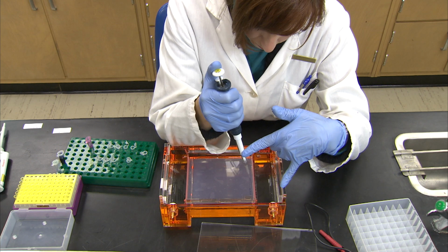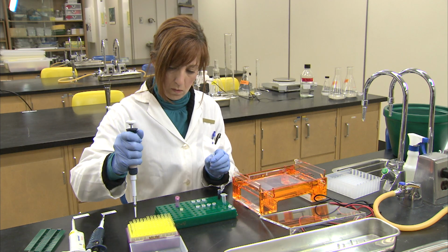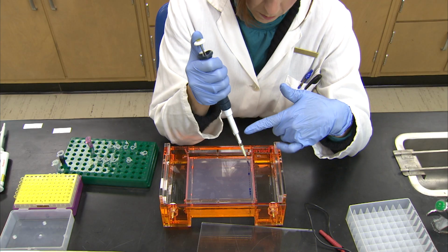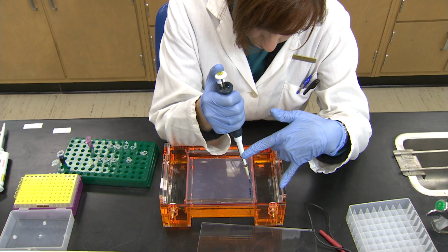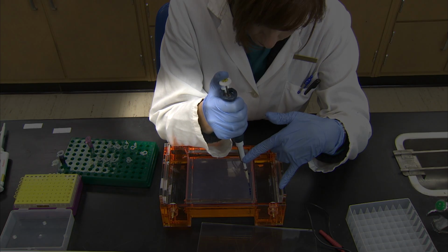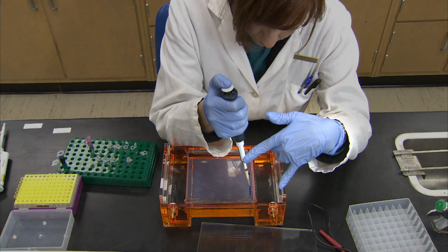Now that all the samples are ready to be loaded, they will be carefully pipetted into the wells of the gel. As a shaky hand can result in the wells becoming torn or stabbed, it may be useful to rest your elbow on the bench or anchor the pipette against your opposite hand.